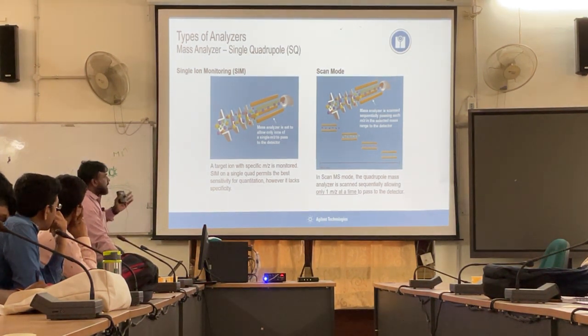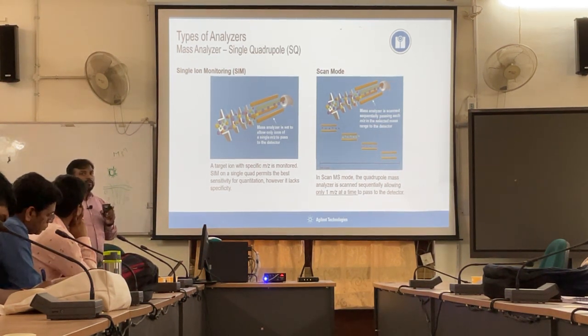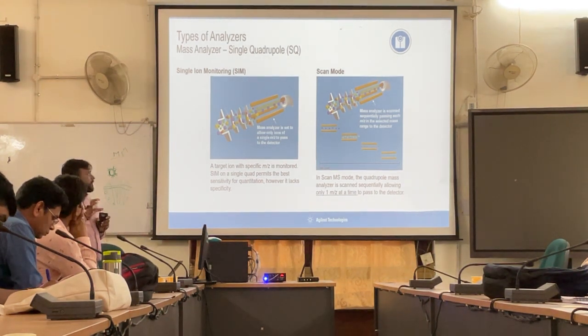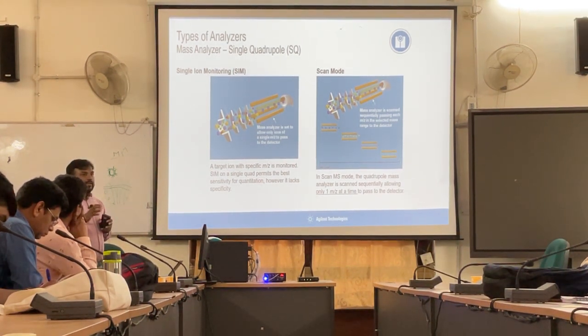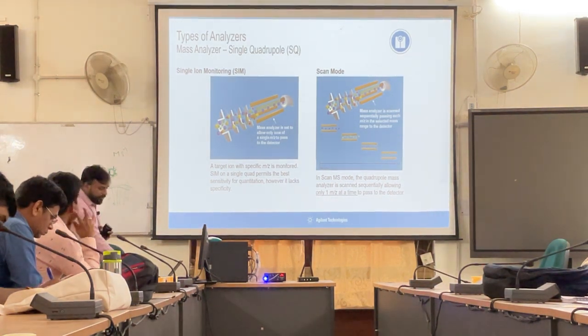Having said that, we can do two experiments. One is single ion monitoring, where we can focus on any particular component molecule present in the mixture. Otherwise we can scan it: if you want to see the profile of a spectrum, then you can run the scan experiment.